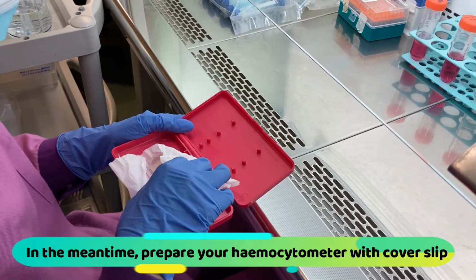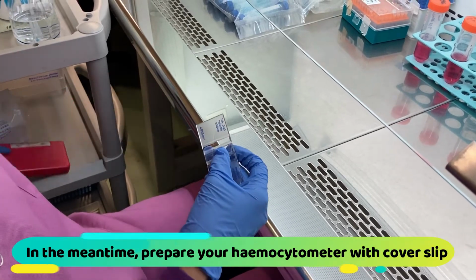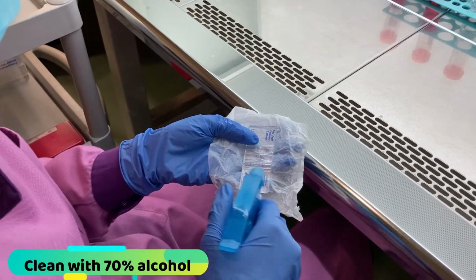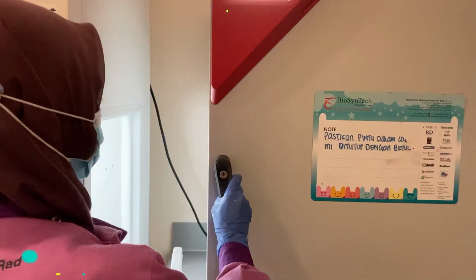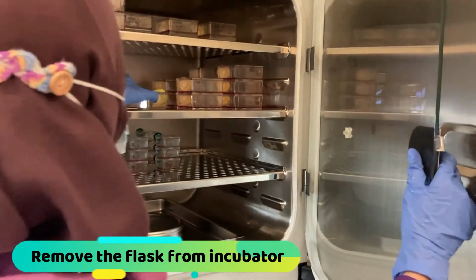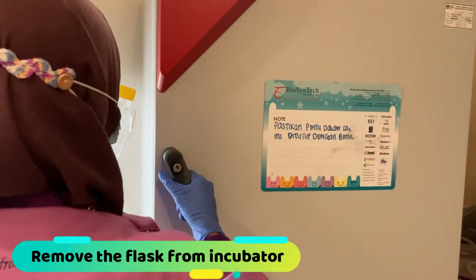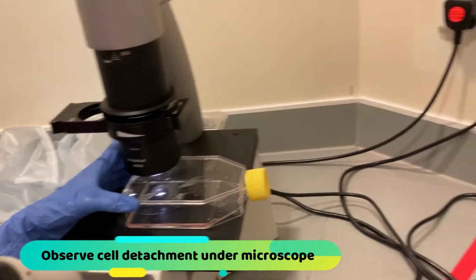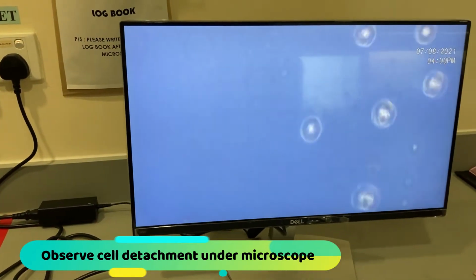In the meantime, you can prepare your hemocytometer with cover slip. Clean with 70% alcohol. And after 1 to 2 minutes, remove the flask from the incubator. Observe for cell detachment under microscope.